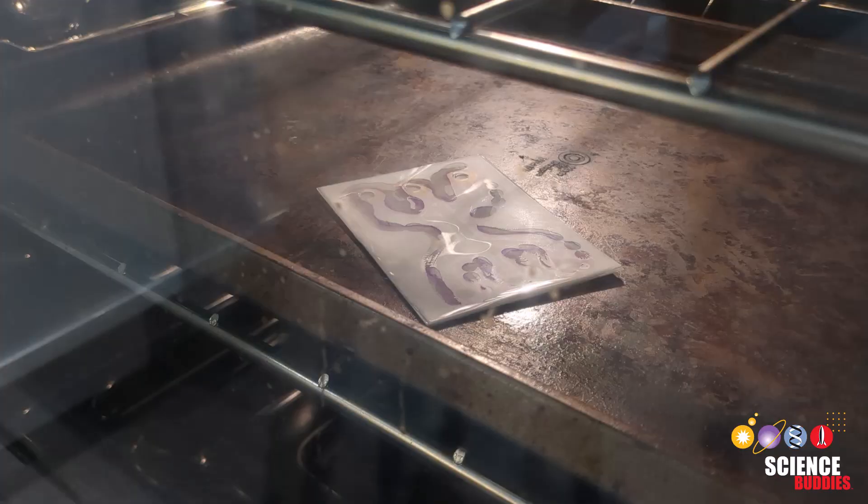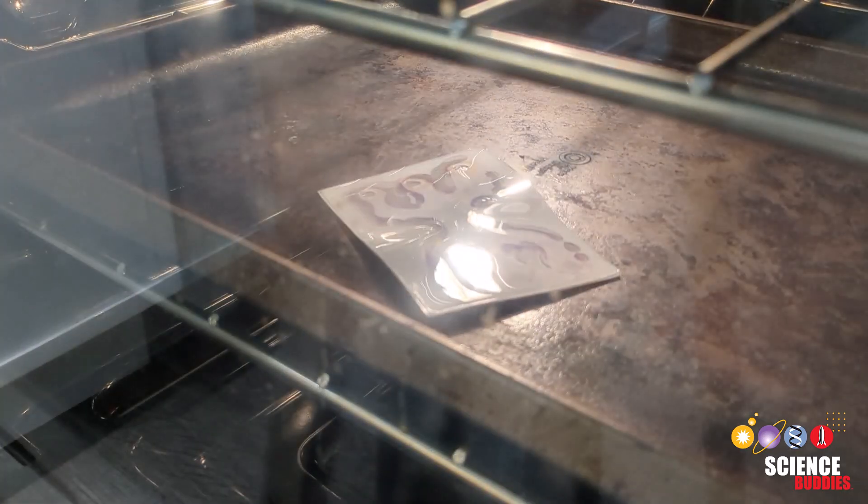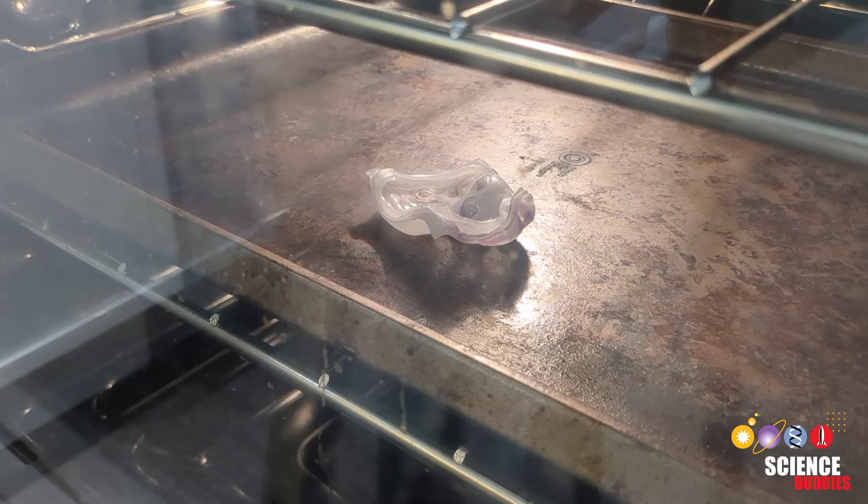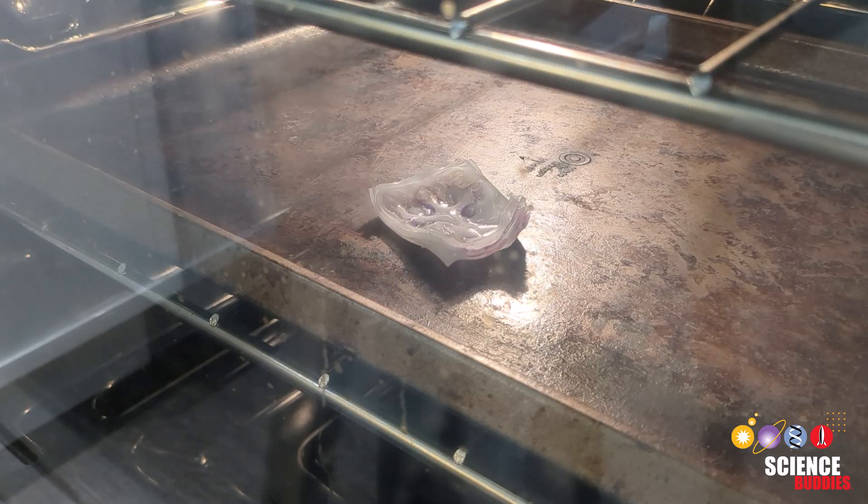Preheat your oven to 330 degrees Fahrenheit with the baking tray inside. After taking your initial measurements, place your microfluidic device in the oven for one to three minutes or until it stops moving.